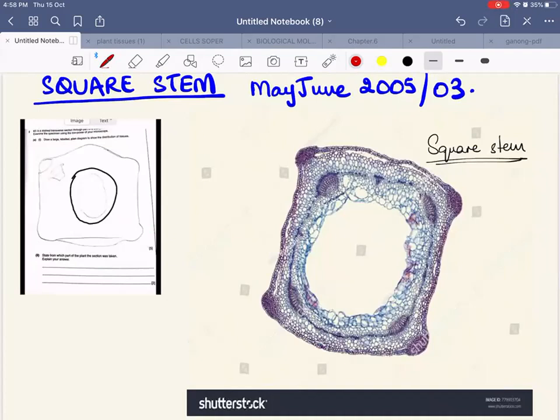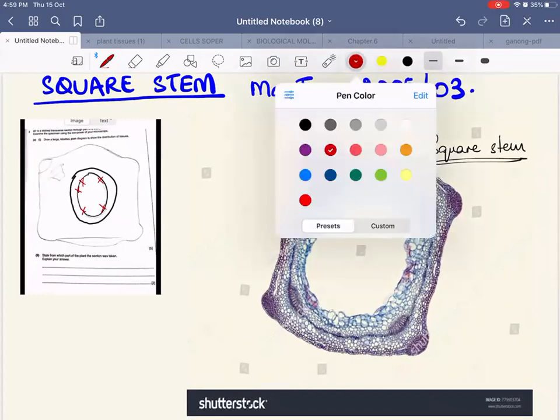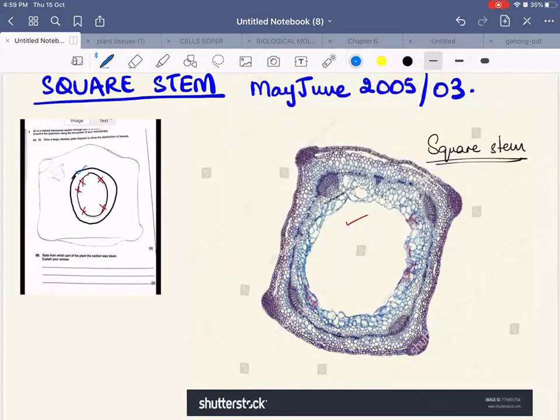I have deliberately drawn this black line to show you that initially I had drawn this plan diagram with this line. This was the wrong way to draw because it's not according to the proportions that I can see in my slide over here. The correct line would be the one which I have drawn outside, this one. This is correct because this is as per the proportions that are visible over here, right?